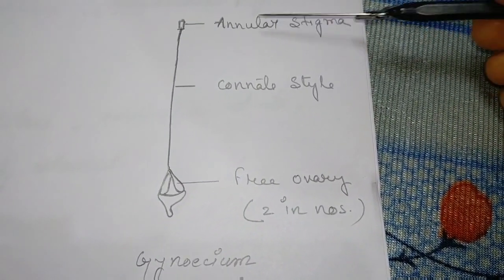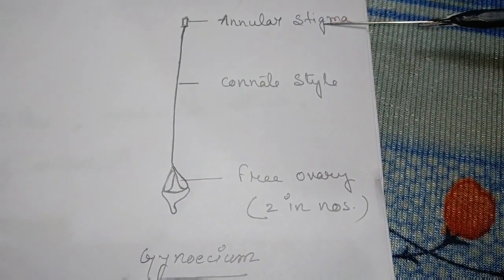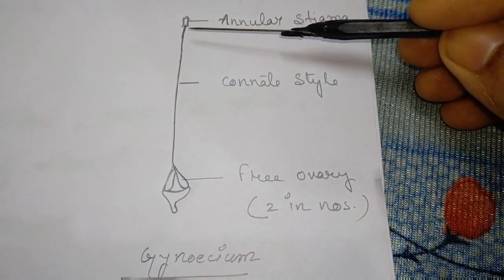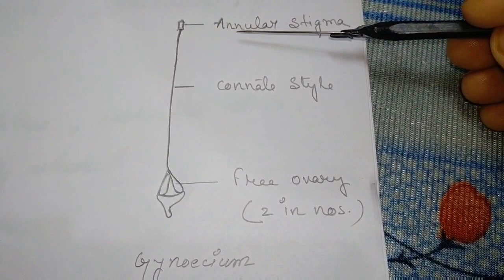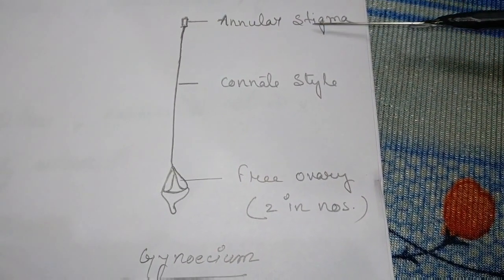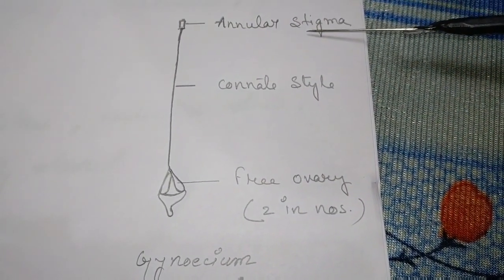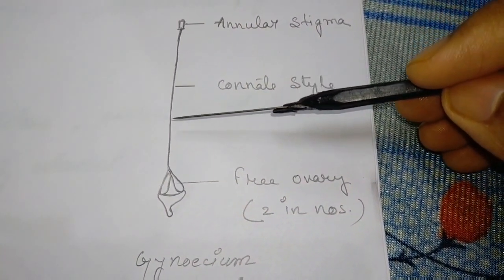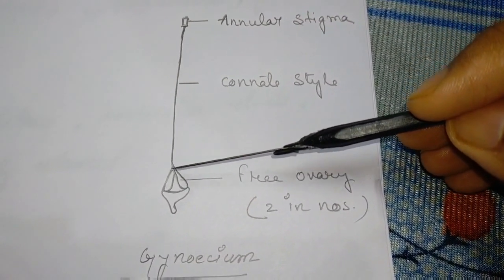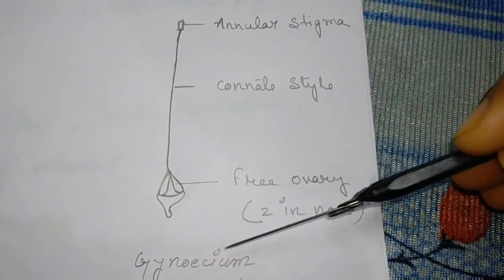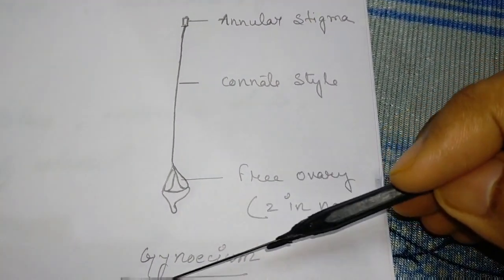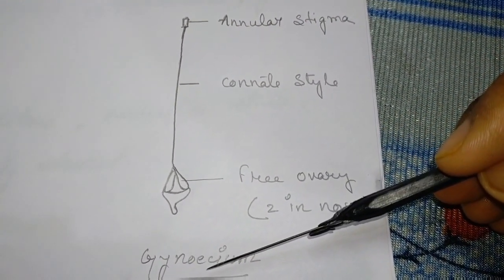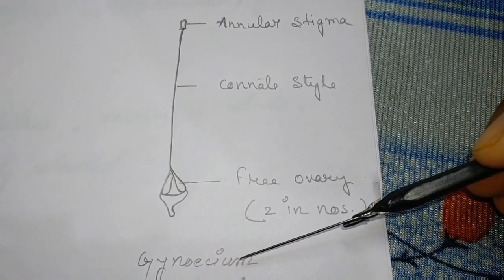The shape of the stigma is drum-shaped, or you can say annular-shaped stigma. The style is a connate style. This is the gynoecium of the periwinkle flower.